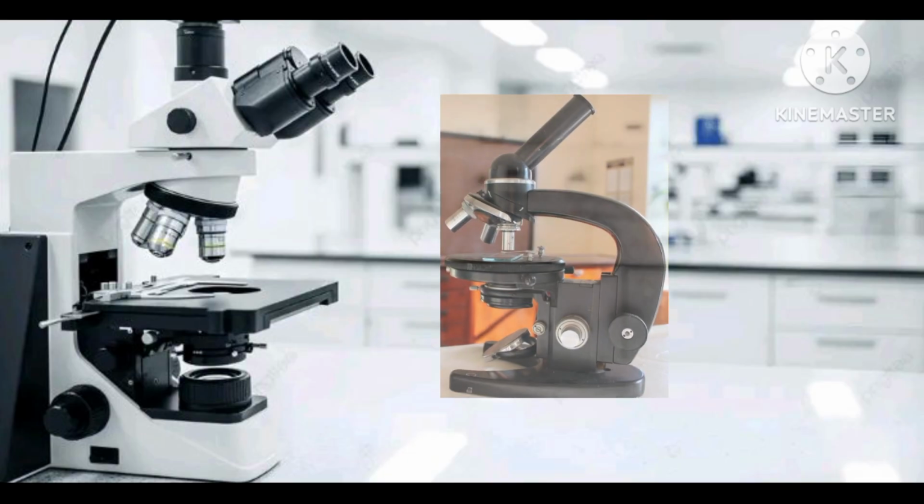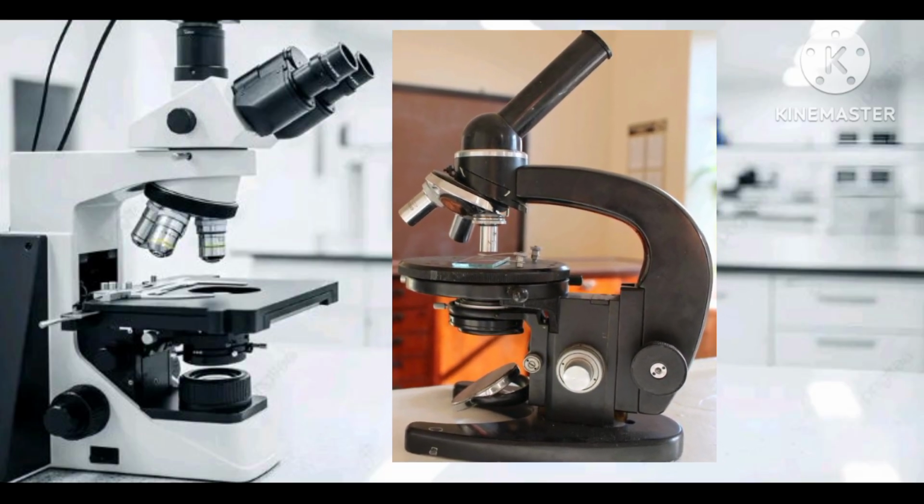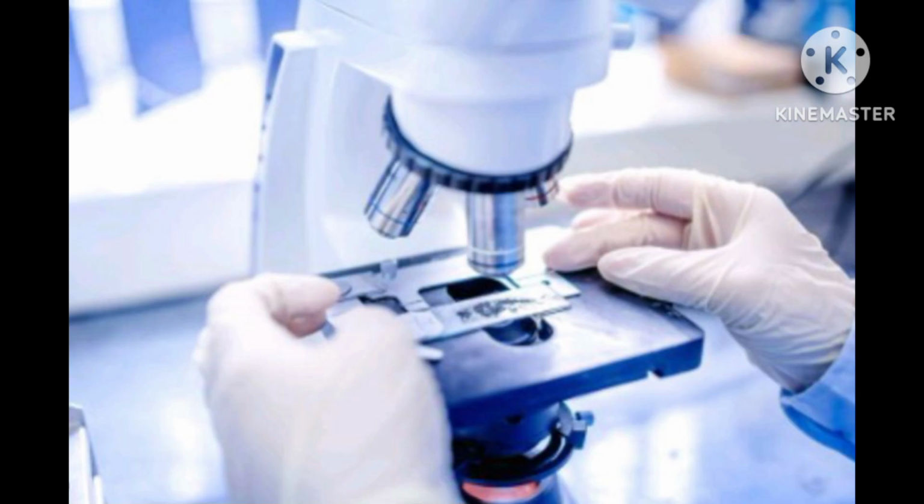The next part is arm. This is the part connecting the base to the head and the eyepiece tube to the base of the microscope. It supports the microscope's head and is also used when carrying it. Some high-quality microscopes have an articulated arm with more than one joint, allowing greater movement of the microscope head for better viewing.